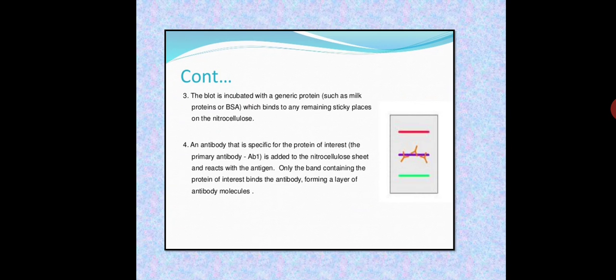तो यहाँ पर हम as a blocking agent BSA और milk use करते हैं so that it covers most areas it can cover. तो ये जो blocking agent है, ये हम नाइट्रोसेलुलोस मेम्ब्रेन में place करते हैं so that it can cover the pores, okay. It can cover the other components present onto that nitrocellulose membrane.